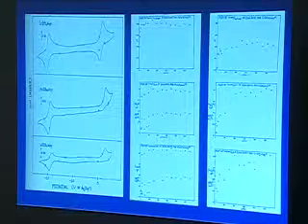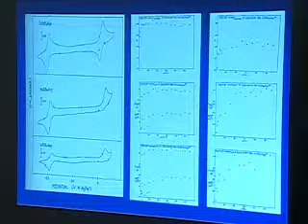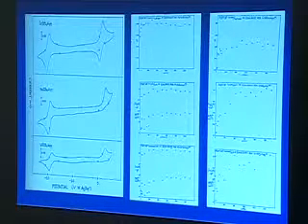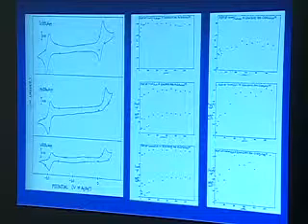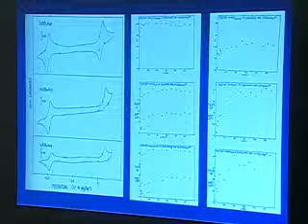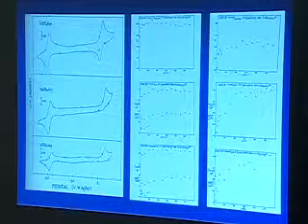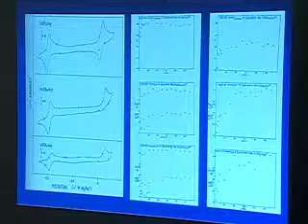And likewise, when you make the plots of peak currents, in particular for these two, you can see that for the reversible case, it would be a horizontal line. That is, the anodic current would equal the cathodic current. And this is baseline corrected stuff. And obviously, those are not horizontal lines. So we have a mechanism going on here. And again, that mechanism is the loss of one of the ligands.